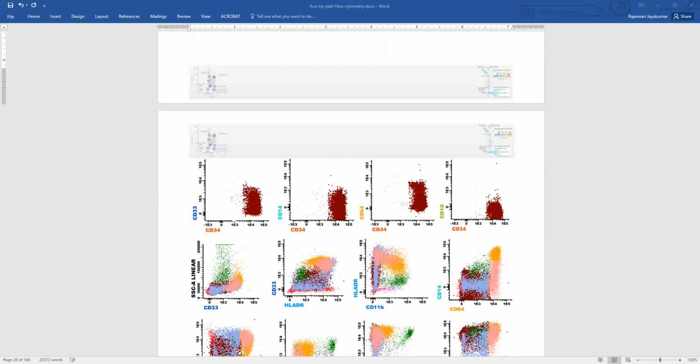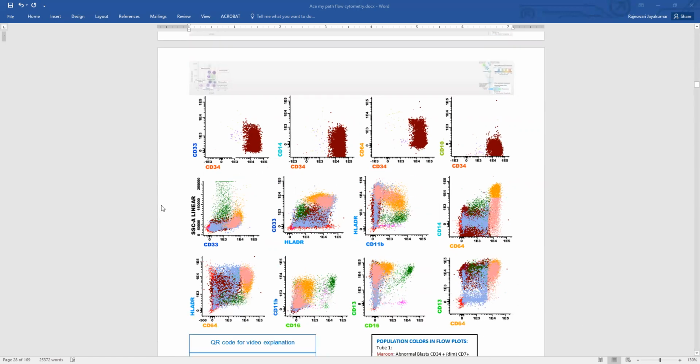14 and 64 are hard to assess without the monocytes to compare, so let's defer to the additional scattergrams that are here. We can compare them with the monocytes and decide their positivity. CD10 is negative. So CD33, we know that the brightest expression is on the monocytes. So the monocytes which are painted orange express the brightest CD33. And then there is a population in crimson here, which has kind of variable 33. I misspoke as 34.